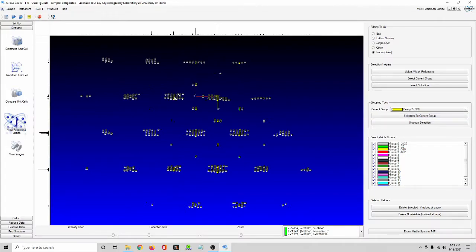So here we go. And it's that one. This one's a little tricky, but it's that one because you can see this intense peak here. It should be in line with. And I'll try to do that on this side too. That selected some that I didn't want.